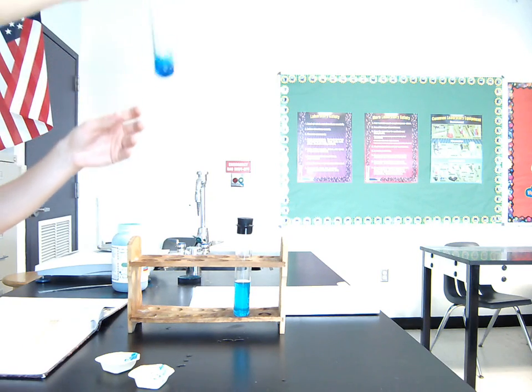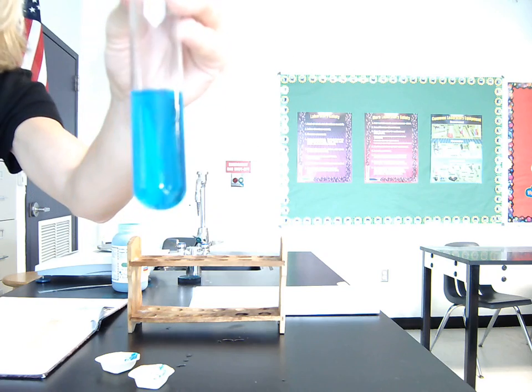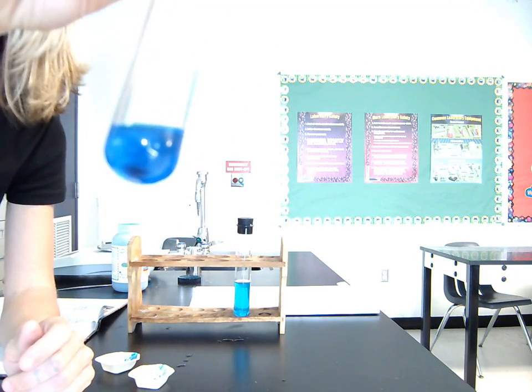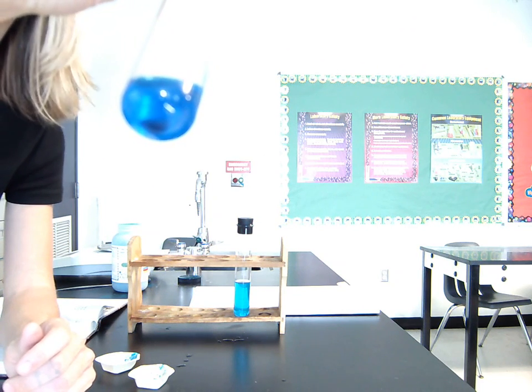Okay. Alrighty. Now, what we should notice at this point, and I have no idea if the camera is going to pick this up, I hope it does, is that this solution, as with the last two times, is completely dissolved. All the blue stuff completely dissolved into the 20 cubic centimeters of water. This is the part I'm not sure if you're going to be able to see. Oh, good. You can kind of see that. What you should notice at the bottom of this test tube is that there's blue solid that is left undissolved.